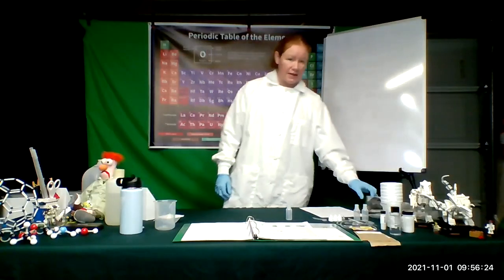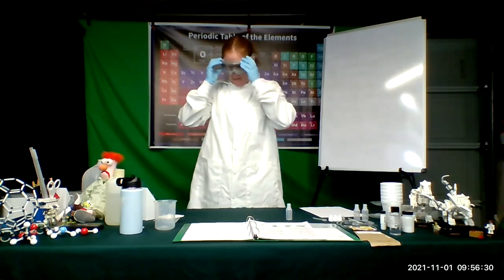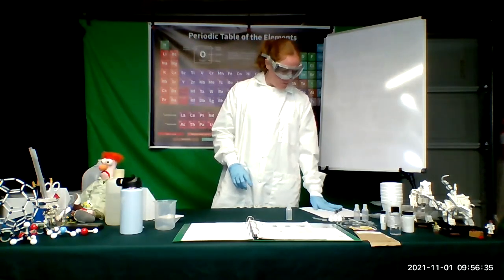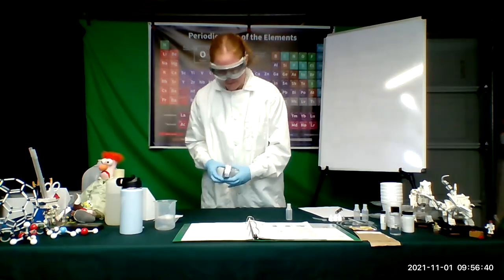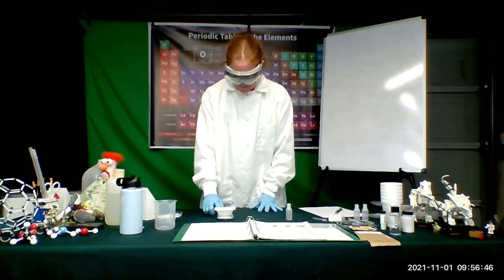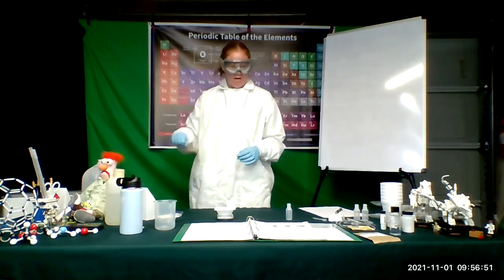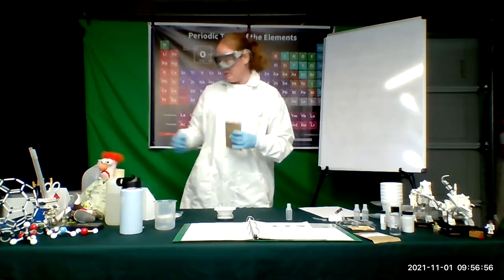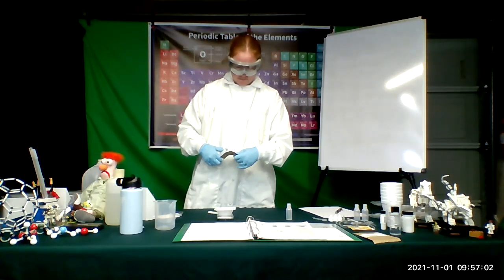Now I'm going to start working with chemicals. I've got my gloves on and I'm going to put my goggles on. I want to make sure that I have a good ink pen to record data as I do my experiment. So now we need to take our balance, put a weigh boat on it, hit the tare button so it subtracts the mass of the weigh boat — so now all I'm going to be getting is the mass of my sucrose. This envelope is labeled sucrose, and I'm going to take some scissors and cut open my sucrose envelope.